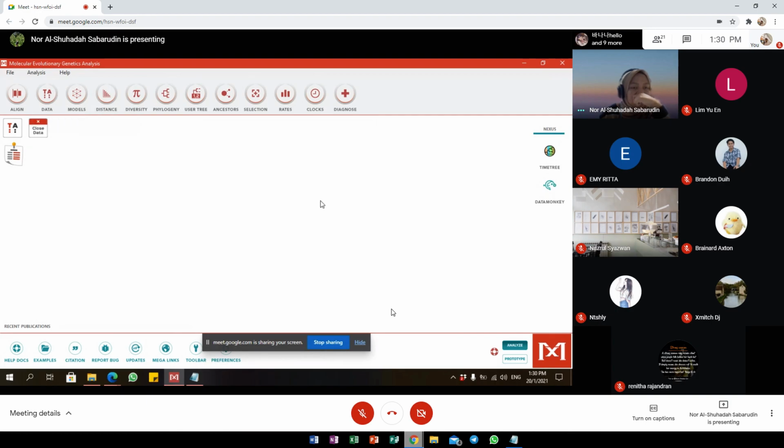So after that, we will do what we call grouping. For my data just now, I have three species, which are Thalanotris pachypus, Thalanotris robustula, and also Dystropus stylopus. And also one outgroup, right? So I have four groups.